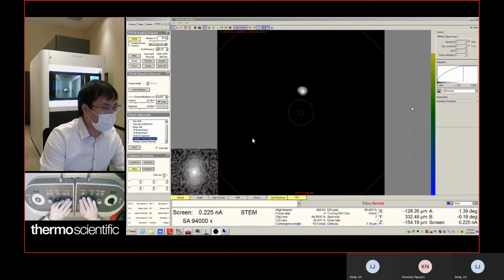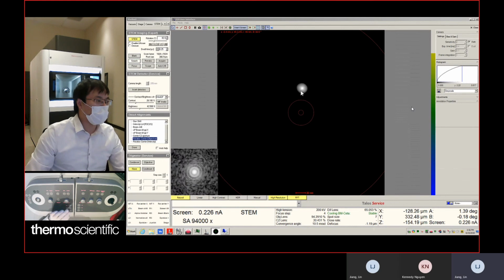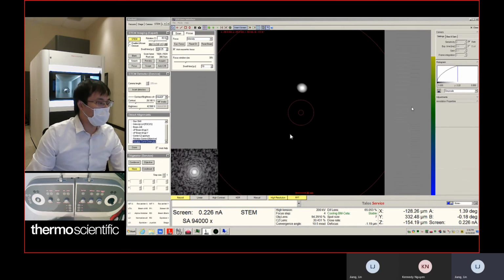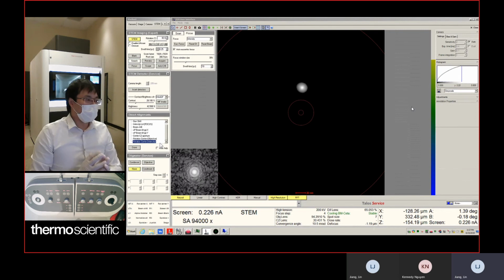You see that central bright spot. This is the central bright spot. You use multifunction X and Y to move this bright spot to the center. Okay, that's it. Then we're done with that. You can do the same here. If you wobble through this, right now you see we're right at the center, so it's being wobbled very concentrically, without any side movement, right?